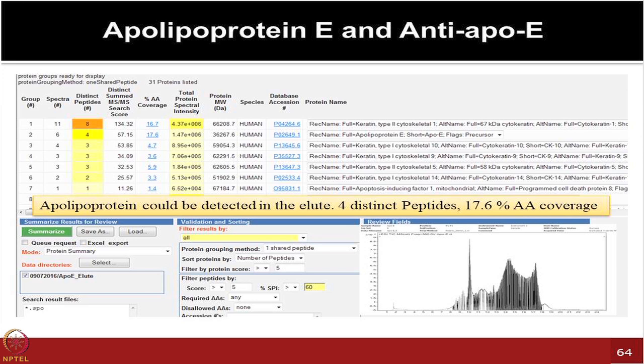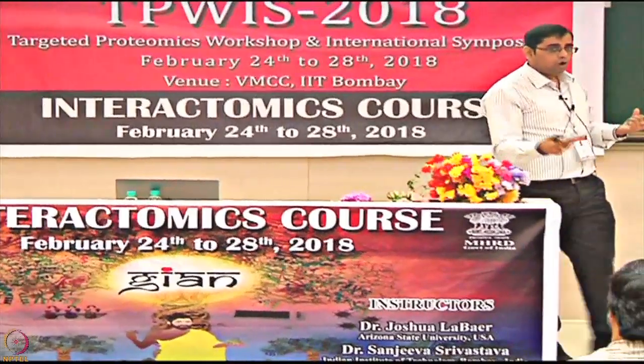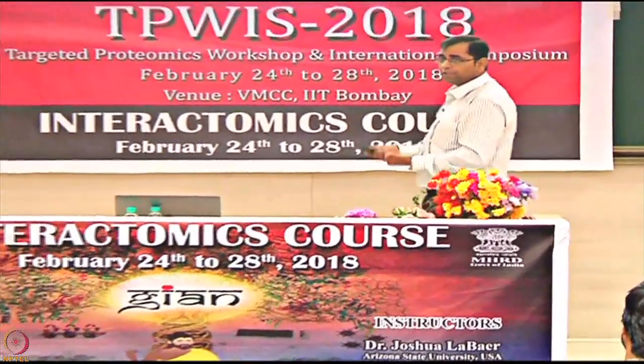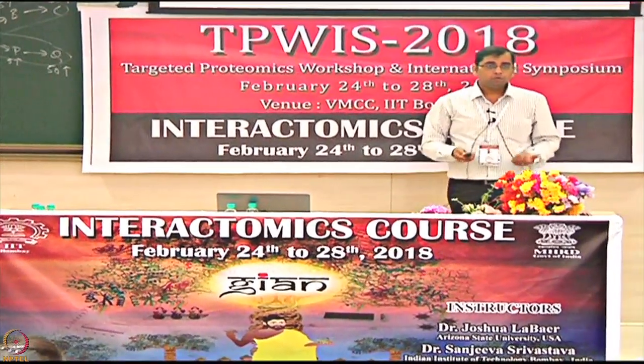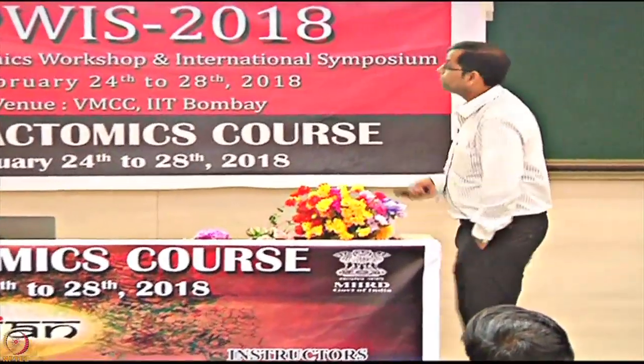But of course, many times you do not have the opportunity to run all 4 flow cells for so many rounds of cycles to really enrich your protein. So how low we can go is what we now have to optimize using mass spec based platforms. But this can be useful for biological experiments when you really want to identify unknown interactors, where you see binding but you do not know the protein of interest. So you can employ both SPR and MS platforms.